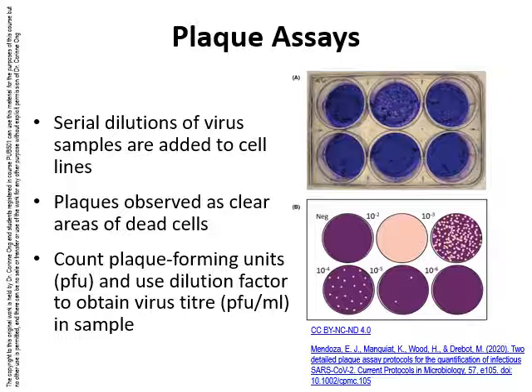In the next well on the top row, the virus sample was diluted to 1 in 1,000, and there are more than 100 clear-colored plaques. On the bottom row, the number of plaques in the wells are small enough to be counted accurately. In the first well on the left, the dilution of the virus sample was 1 in 10,000, and there were 21 plaques observed.